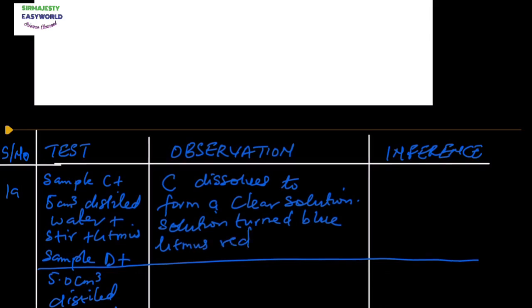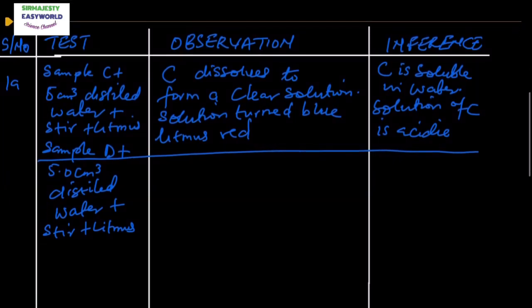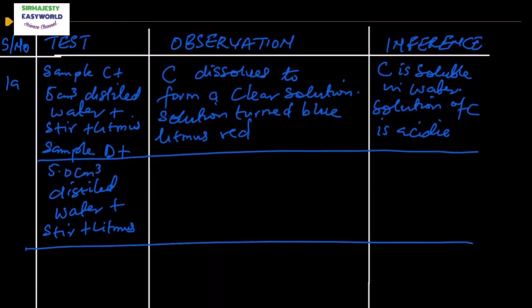Your inference will be: sample C is soluble. Solution of C is acidic.